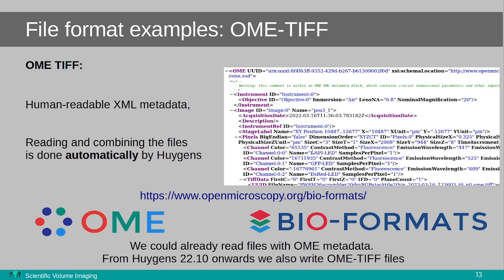This is a microscope image standard that describes how to read and write 5D datasets with information like what objective lens was used, the numerical aperture, the lens's refractive index, and even emission and excitation wavelengths and much more. These are all very important for creating a theoretical PSF for deconvolution in Huygens. Huygens can read these parameters automatically, and since version 22.10 we also write OME-TIFF files.